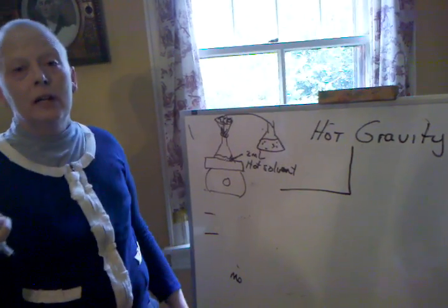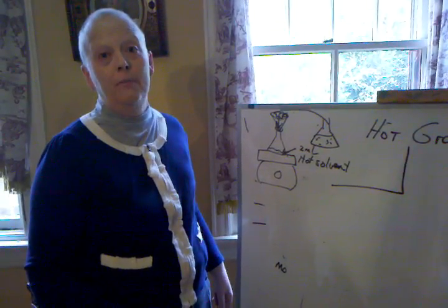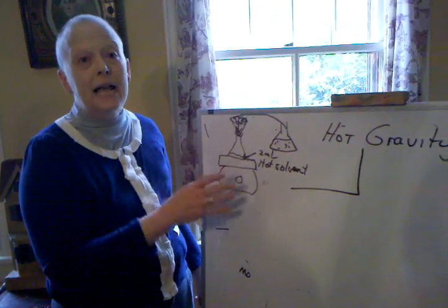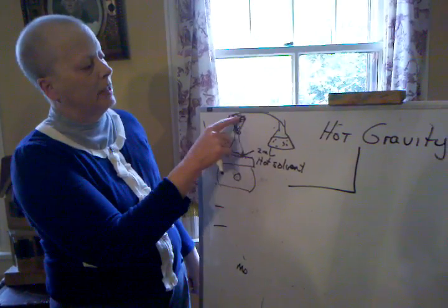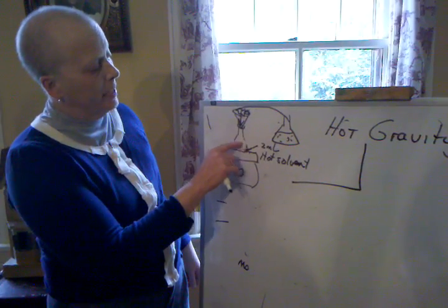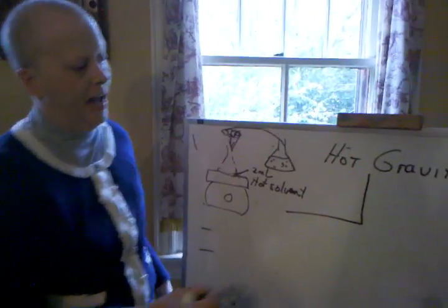If you take your cup of hot tea that's filled with sugar and you bring it down to ice temperature, you would see sugar crystallizing out. The desired compound is going to be in solution here. The undesired compound, you're filtering it out. It has to go fast, because if it percolates through slowly, the crystals are going to form up here. We want the crystals to form down here. So the design here is to create some vapor that's going up on this funnel, warming it, and then having a large surface area so the filtration is really fast.